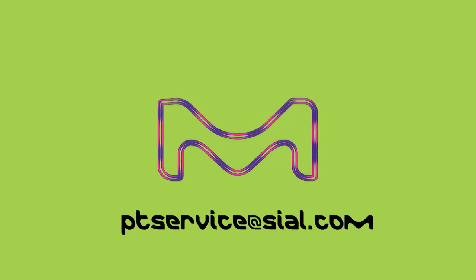That completes our training for data entry using the new Proficiency Testing Portal. If you have any questions, please email ptservice@sial.com. Thank you.